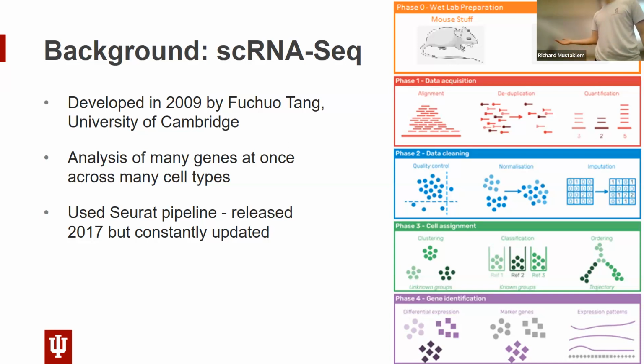And so Seurat is a pipeline that was produced in 2017. It was made by Satija, I don't know his full name, but his last name is Satija. And basically he made the Seurat pipeline, and this pipeline basically boomed the industry for single cell. It's not just in RStudio, it's in Python and many other languages as well, but it's mainly used in R because scientists just use R. It's kind of like the science program, but Python is very popular as well. And this is what we're going to go through today.